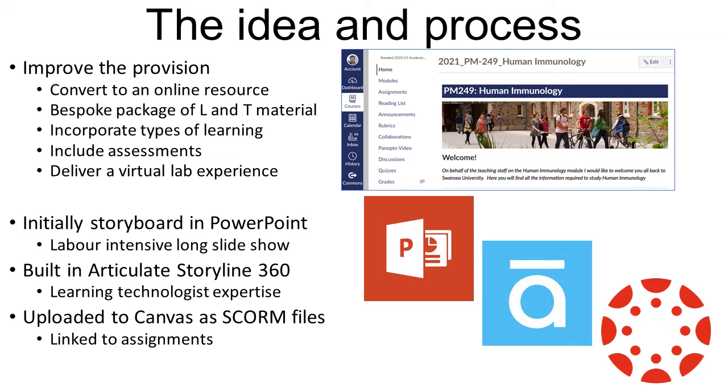This enabled us to produce a virtual lab experience including flow cytometry, data analysis and patient diagnosis from flow cytometry plots in different parts. Initially, Nigel and I generated a labour-intensive, incredibly long slideshow in PowerPoint. Then Dave built these slides into Articulate 360 before uploading to Canvas as SCORM files that could ultimately be linked to the assignment's functionality.